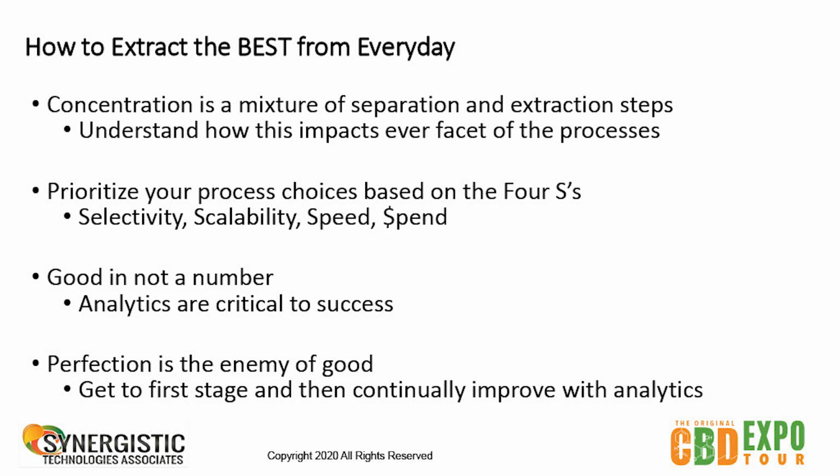You don't need the highest quality, brand new, spick and span system, like the system we saw way in the beginning with UPLC and mass spectrometers and the bungee cord of the PhD to that instrument. You really need enough material to be able to decide whether the spot on your thin layer chromatography is there or it's not there. So you can take that deep red spot from the starting material, put another bit of material next to it, and then do a thin layer chromatography and see if there's a change in what you're getting for compounds coming out.